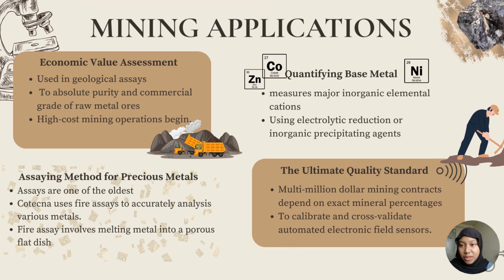Second, we have quantifying base metals. The method measures major inorganic elemental cations such as cobalt, nickel, copper, zinc, and tin. For the third one, we have assaying methods for precious metals.